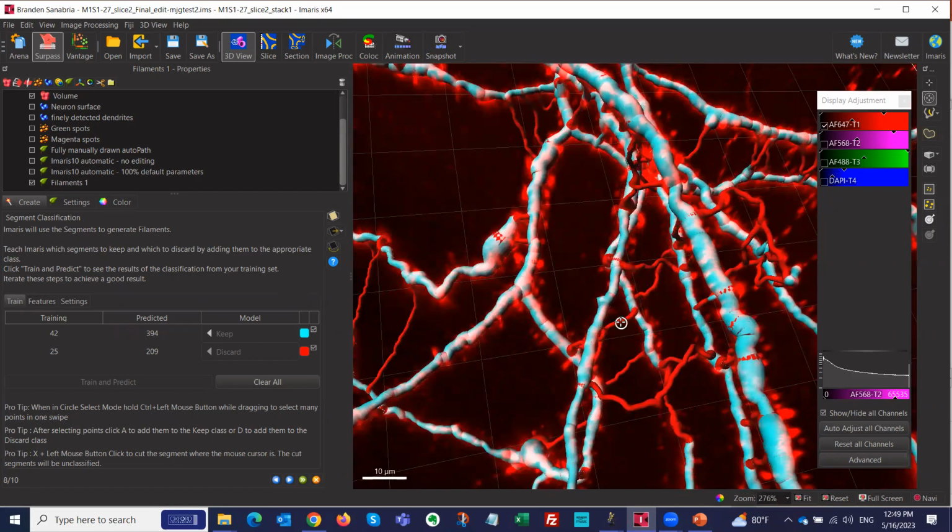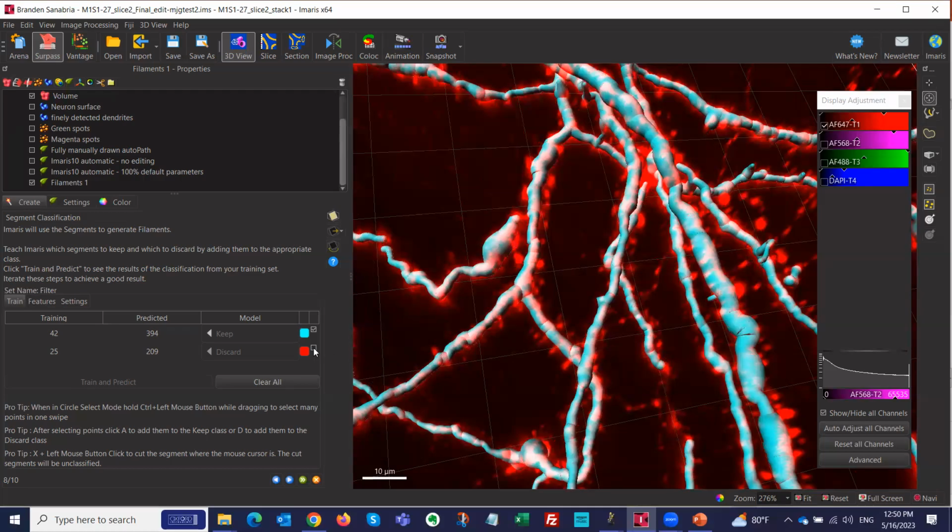Why does it do it? It's because it's doing much faster parallel computing. It's doing blockwise processing. So it starts somewhere. It doesn't know where it's ending at the end. So it's going blockwise. So it has those connections. And then once it connects the puzzle after it's done, it has the connection, but it knows, okay, there was nothing in between. So it knows it and it will take red immediately. If this bothers you, you can always turn off the red and just look at the green, okay?